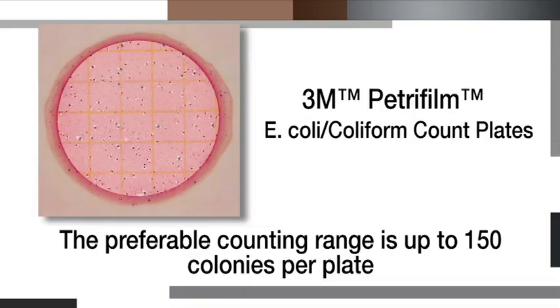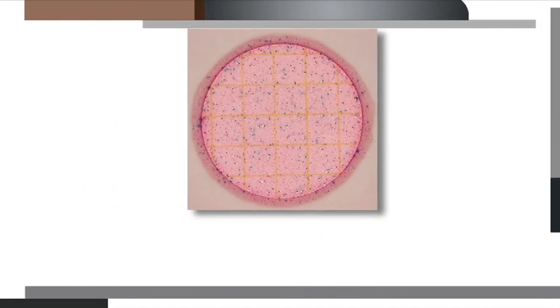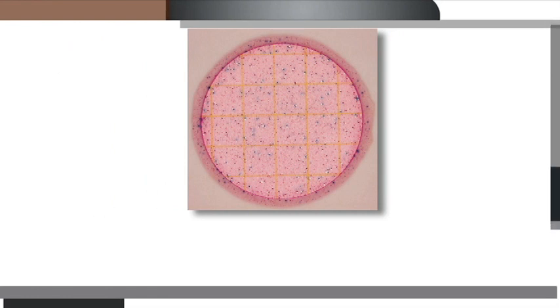The preferable counting range for the 3M PetriFilm E. coli coliform count plate is up to 150 colonies per plate. For counts over 150 colonies, you can estimate the count.